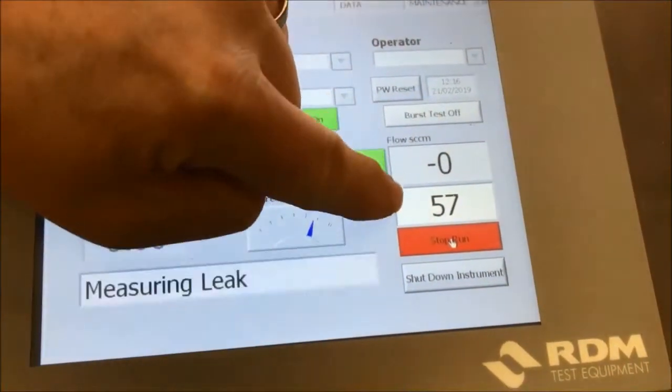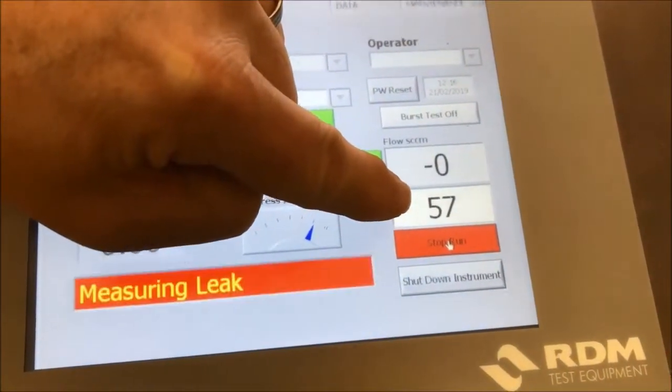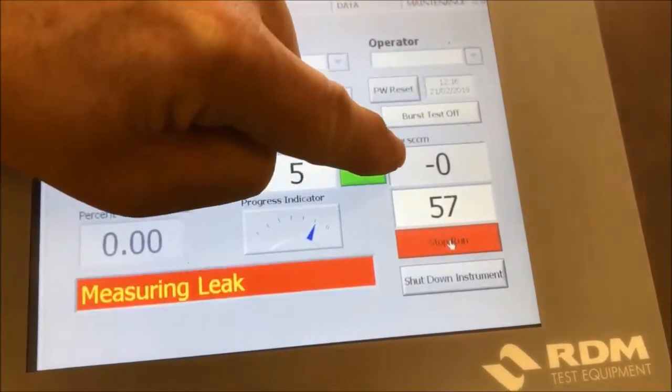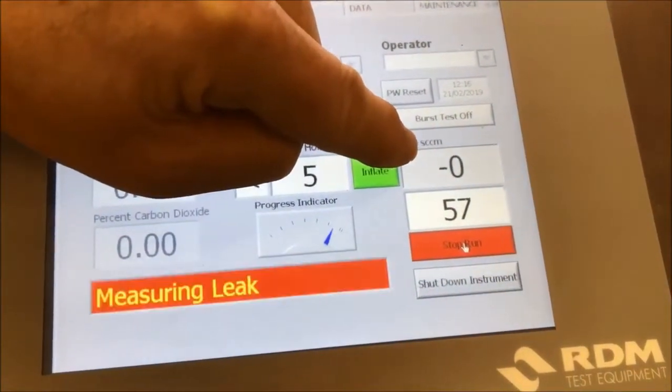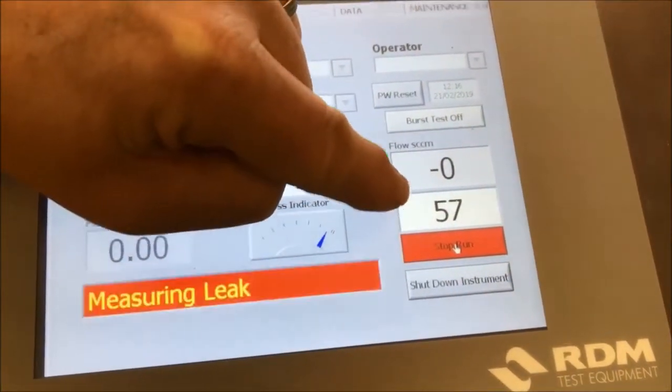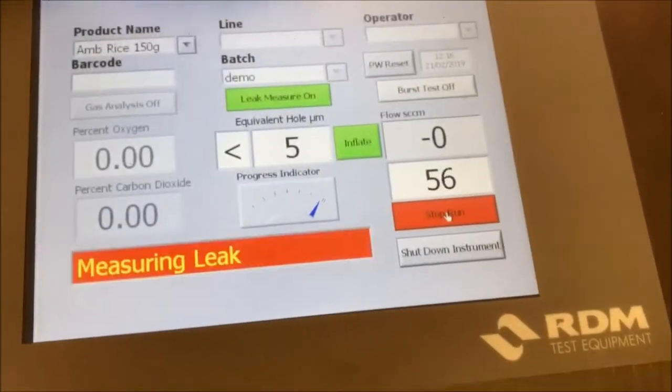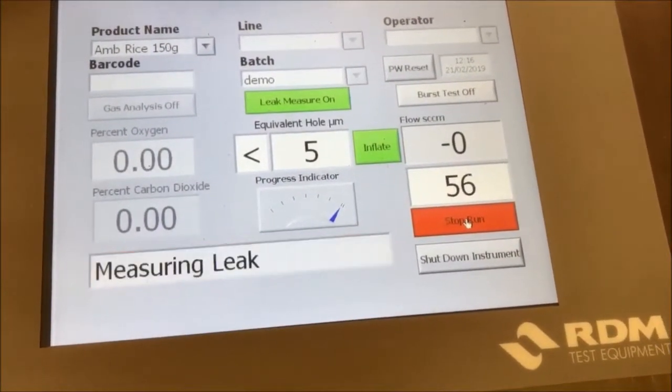These are the numbers, by the way. This is the pressure in millibars that we are holding that pack at, and this is the flow in SCCM that we're having to put into the pack to maintain this pressure. As you can see, it's zero, so the pack is holding pressure perfectly.